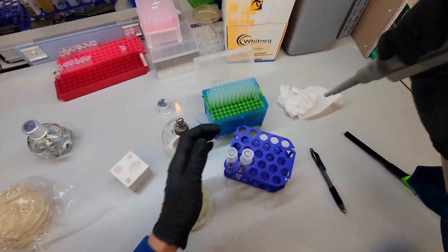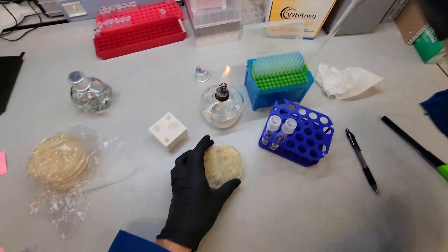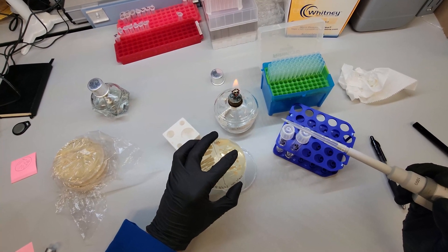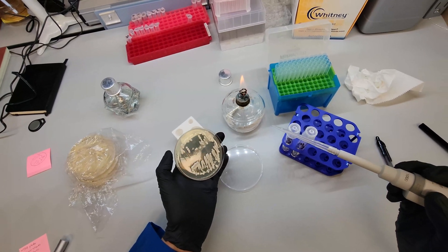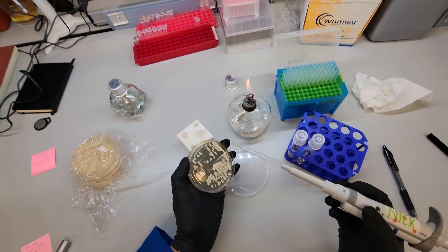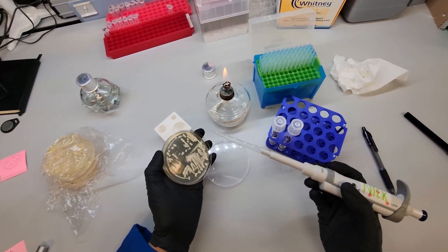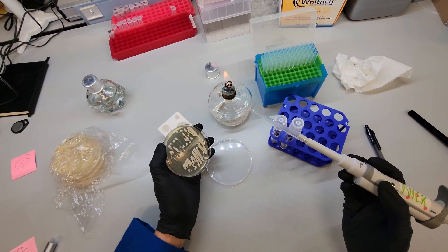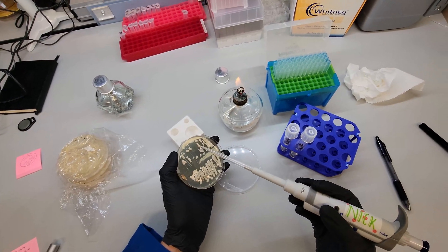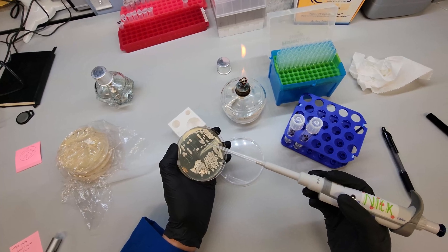Alright. So I did that first one pretty fast. So the second one, I'll do a little slower. This is the Z12 strain. That's what we want. I like to put my finger on the plate because when you flip it over, you might lose your place on the plate if there's more than two strains on there. This plate again has grown way too much. We want to lift it up to the air as little as possible, but I'm just demonstrating here.